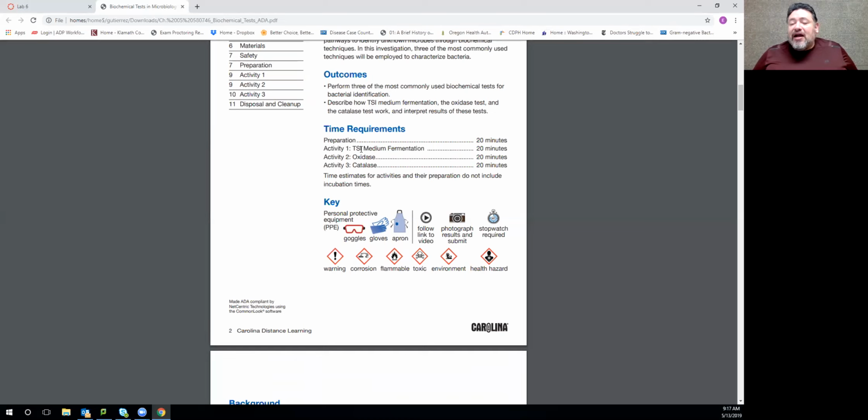And then the iron is supposed to detect the presence of not obligate anaerobes, but anaerobes, okay? So if you remember, one of the descriptions for an anaerobe is a microorganism that either does not use oxygen or uses something other than oxygen as a final electron acceptor. So with these, what we have is an iron moiety that's very heavy.